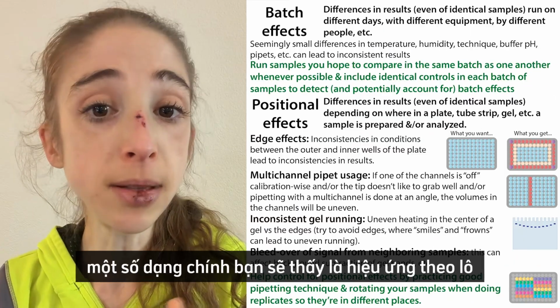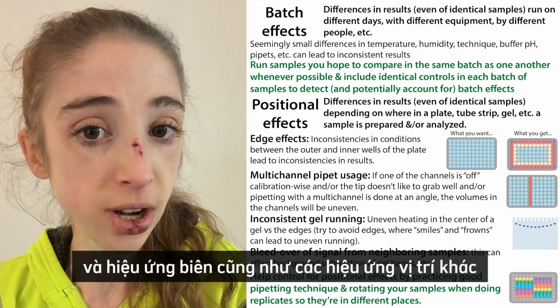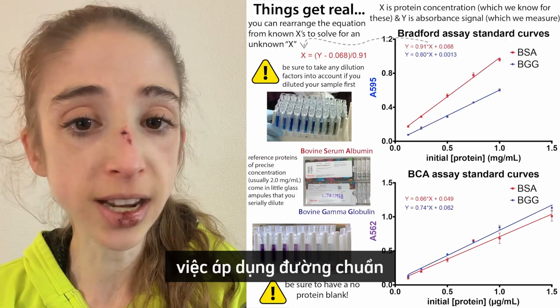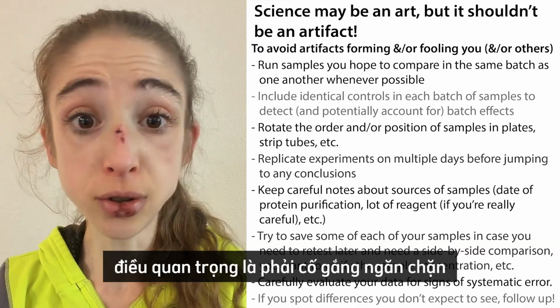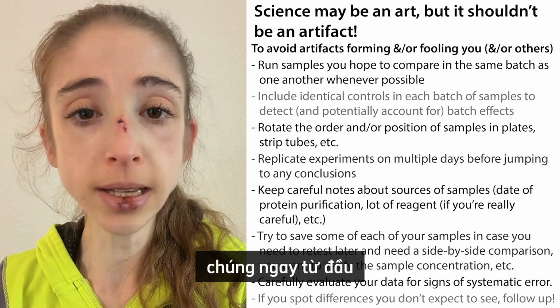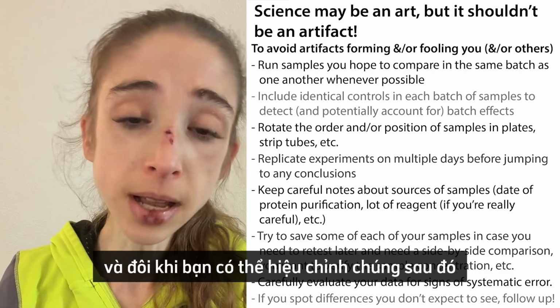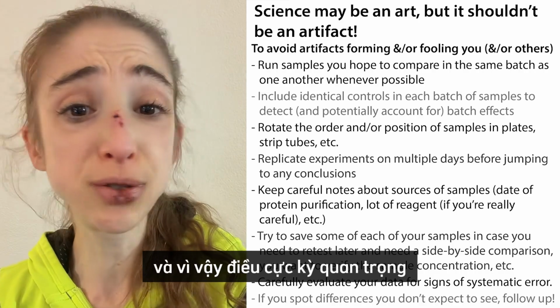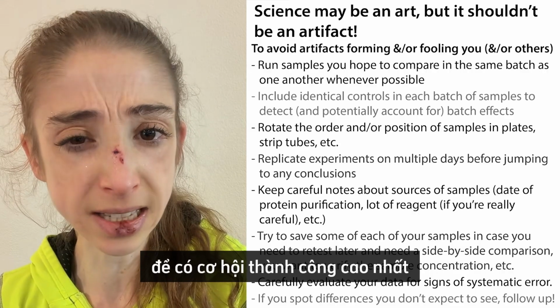Some of the main ones you'll see are batch effects and edge effects, as well as other position effects and other differences in techniques, standard curve application, these sorts of things. It's important to try to prevent them from happening in the first place, and then be able to detect them if they do happen. Sometimes you can correct for them after the fact, but a lot of the time you can't, and therefore it's really important that you set up your experiment to have the biggest chance of success.